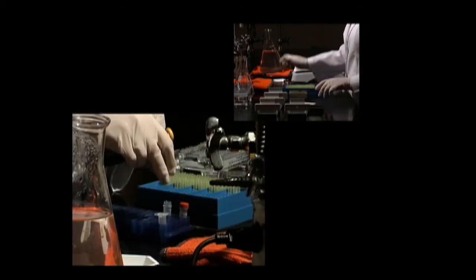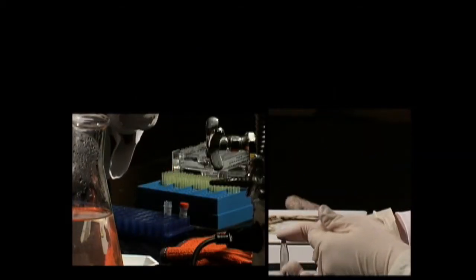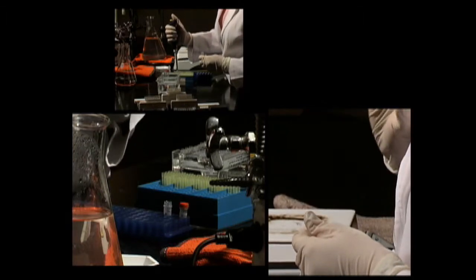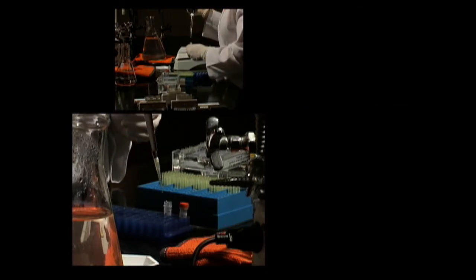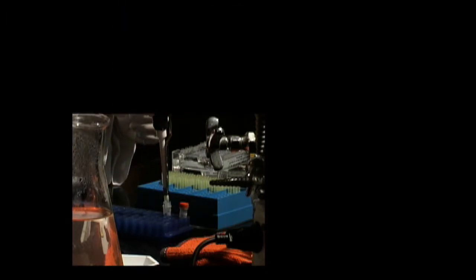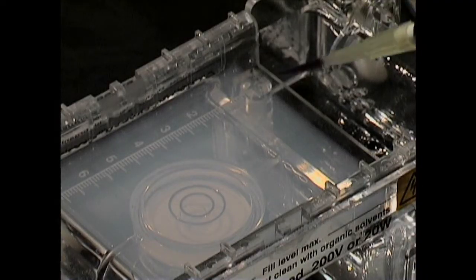Before loading the sample, it should be heated to 65 degrees to break down unwanted aggregates. To prepare the sample for placement in the gel, mix it with 5 microliters of gel loading solution. Then load it into a sample well, taking care not to tear the gel.